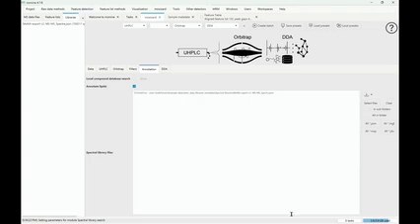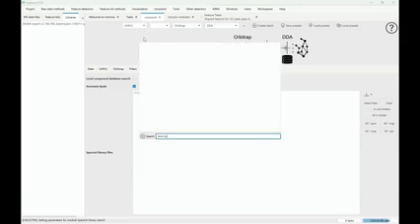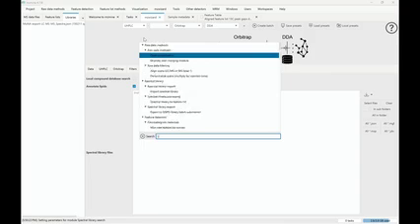Yeah. So maybe, looking at the time, I think we should also move on. And I have one question about the lipid annotation. Yes. Is there somewhere specified what rules are used for the annotation? And if we have a specific lipid class that is not included, can we add our own rules there?